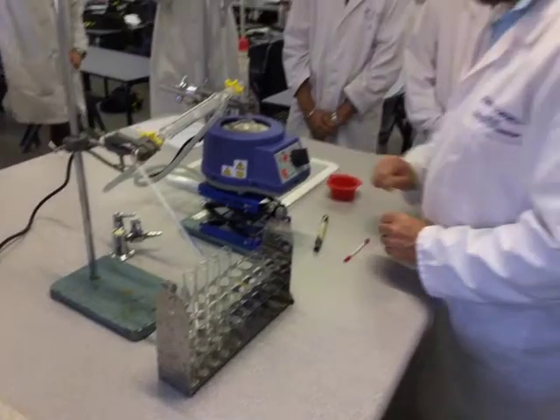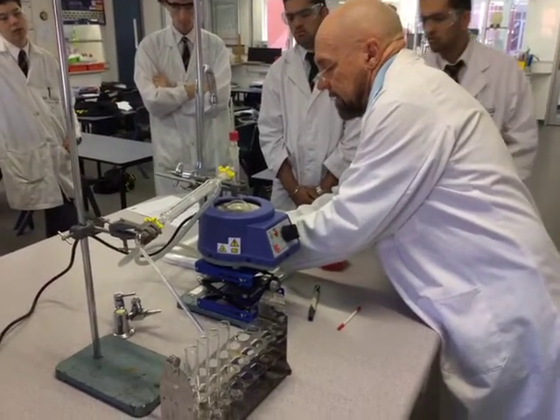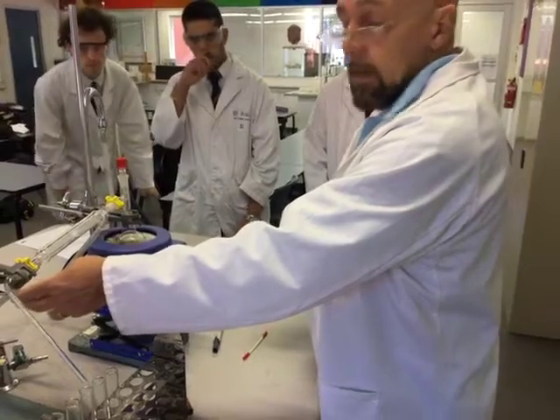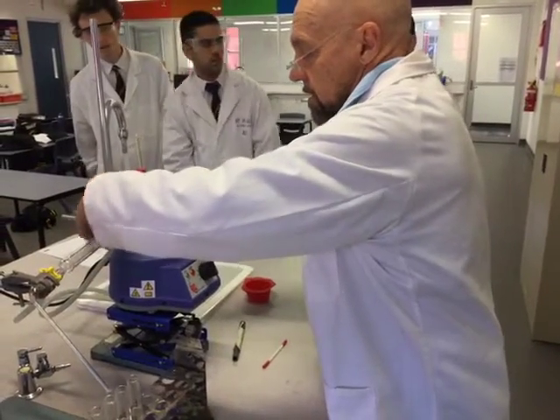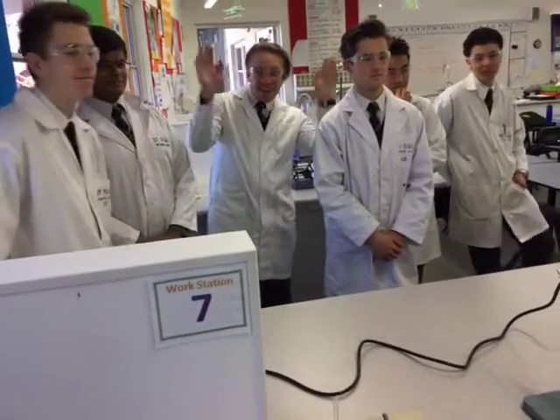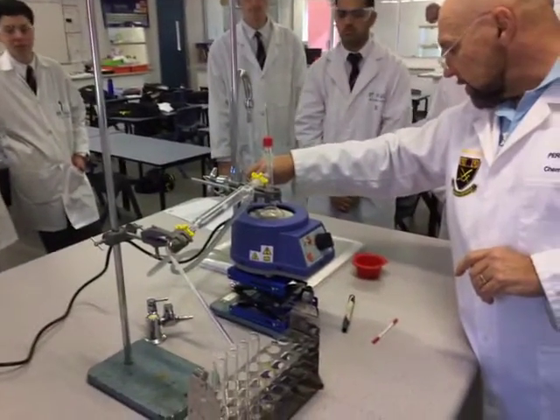We've got to make sure the water is actually turned on. Which direction does the water go in the condenser? Uphill — it always goes uphill. What I'll do is actually turn it on now, slowly — it's ready to go.